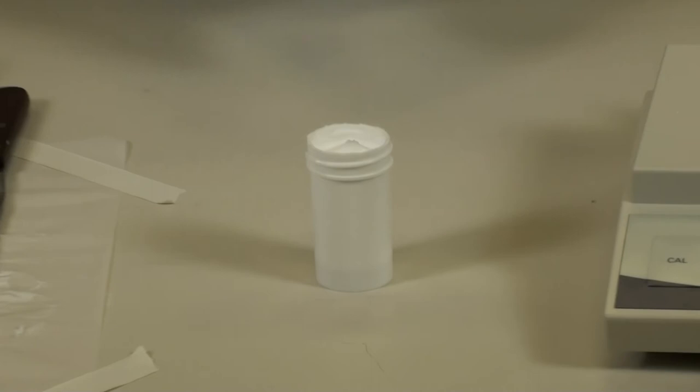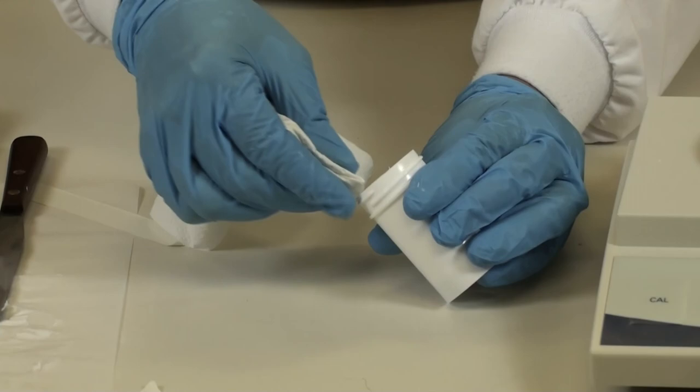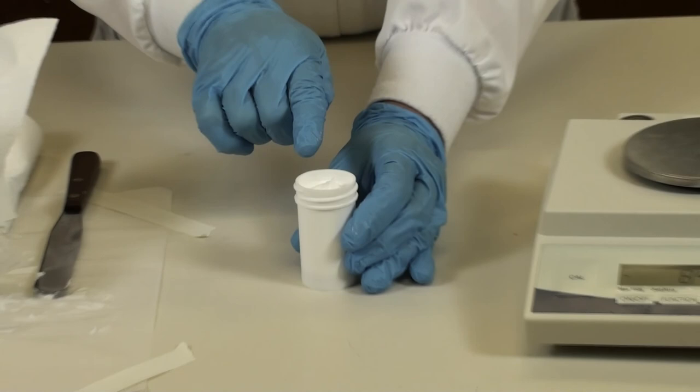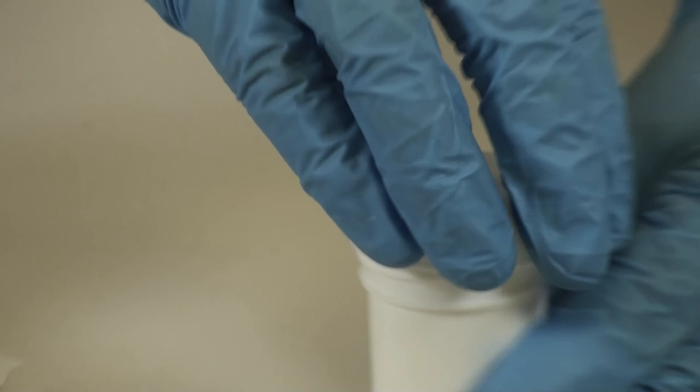All right, using another paper towel, go ahead and clean off the outside of your ointment jar, ensuring there's no cream around the threads or the body of the ointment jar. And then using a tip, go ahead and just clean out any excess that rode along the top. Your final check is to put your lid onto your ointment jar and make sure that no cream remains on the top of the ointment jar. Your cream is now ready to be dispensed.